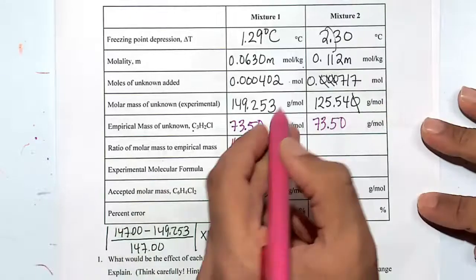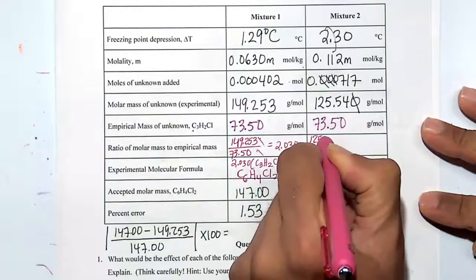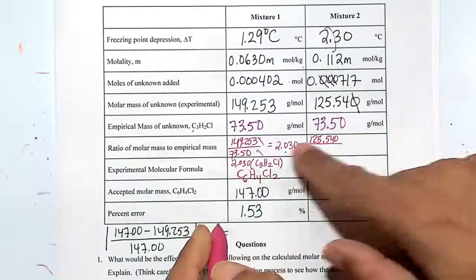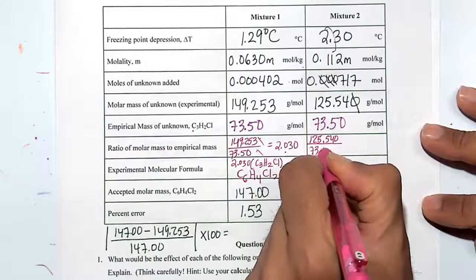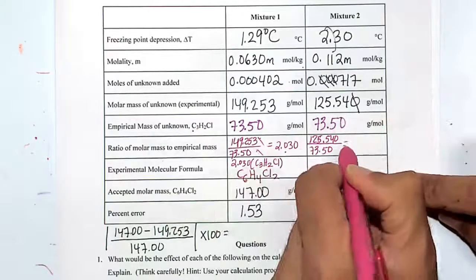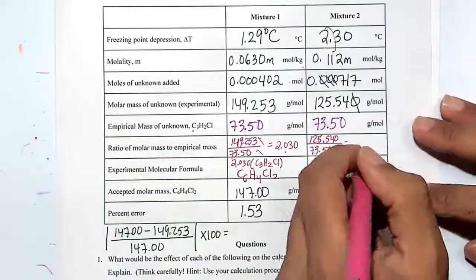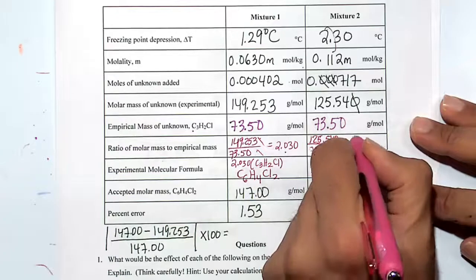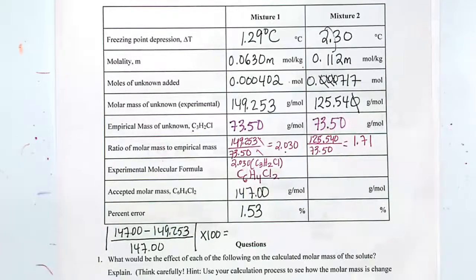Calculated molar mass of the unknown is 125.54 grams per mole, divided by the empirical mass of the unknown we got from our periodic table, which is 73.50 grams per mole. The grams per mole and grams per mole cancel. And on my calculator, figuring out our factor, the factor I'm getting is about 1.71. All right, so if you want to round it, it will be about 2.